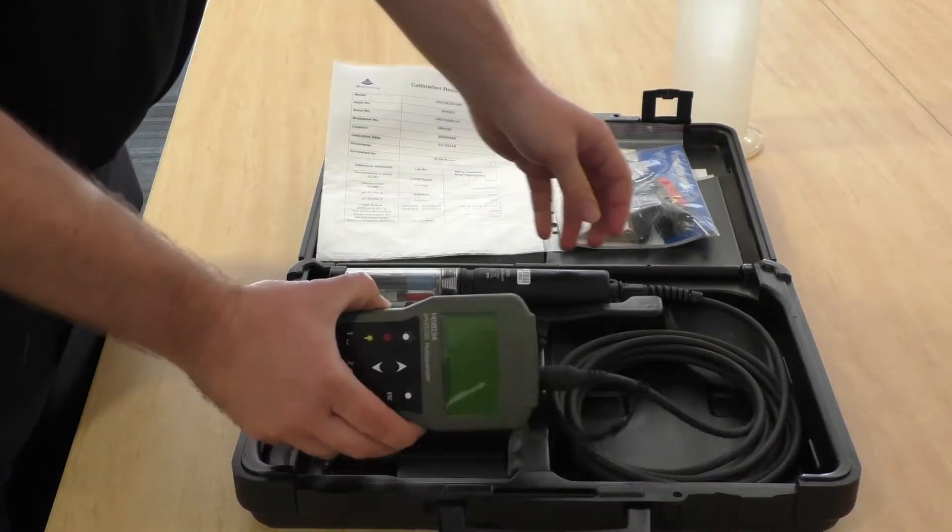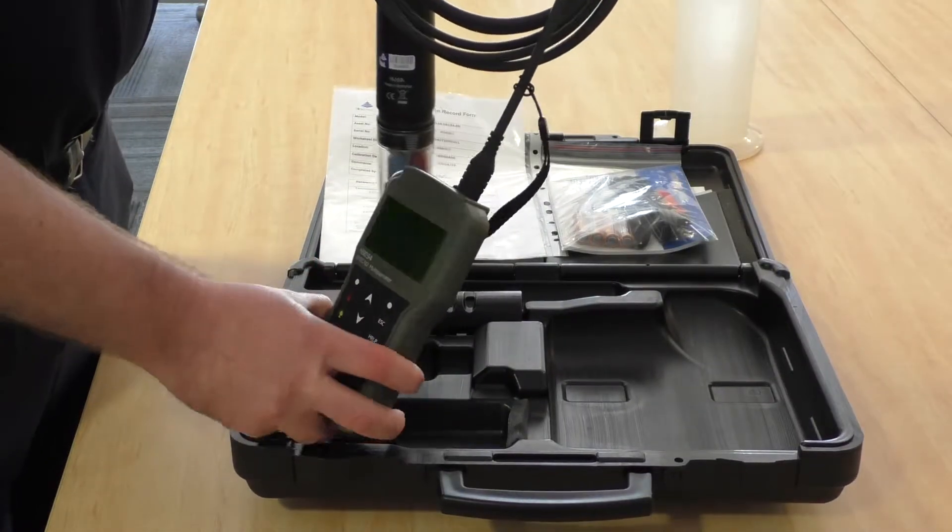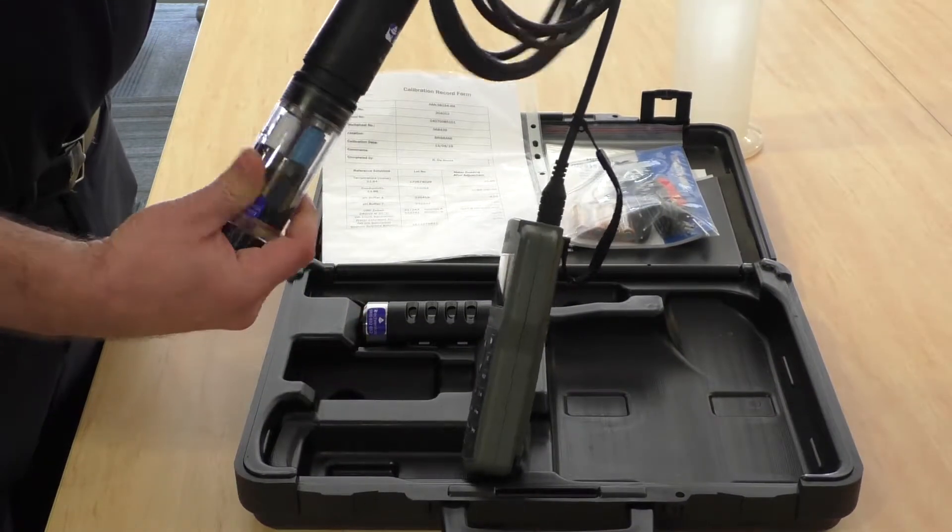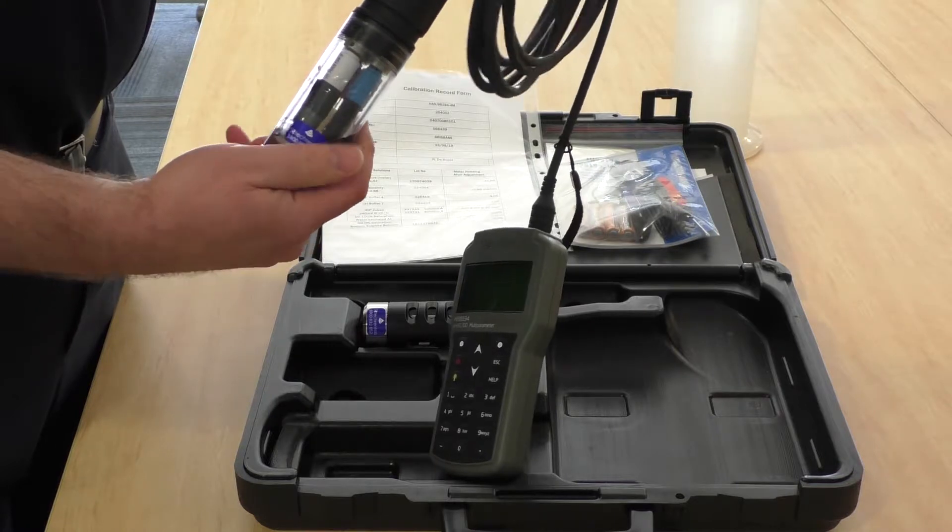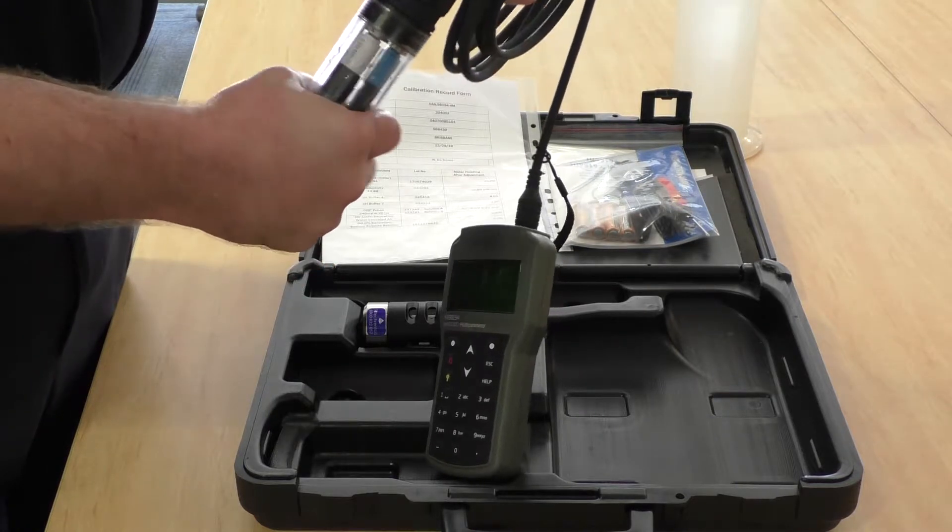Looking at the meter itself, it comes with a 4 meter cable. The meter will come stored in its calibration cup with some water to keep the sensors moist.